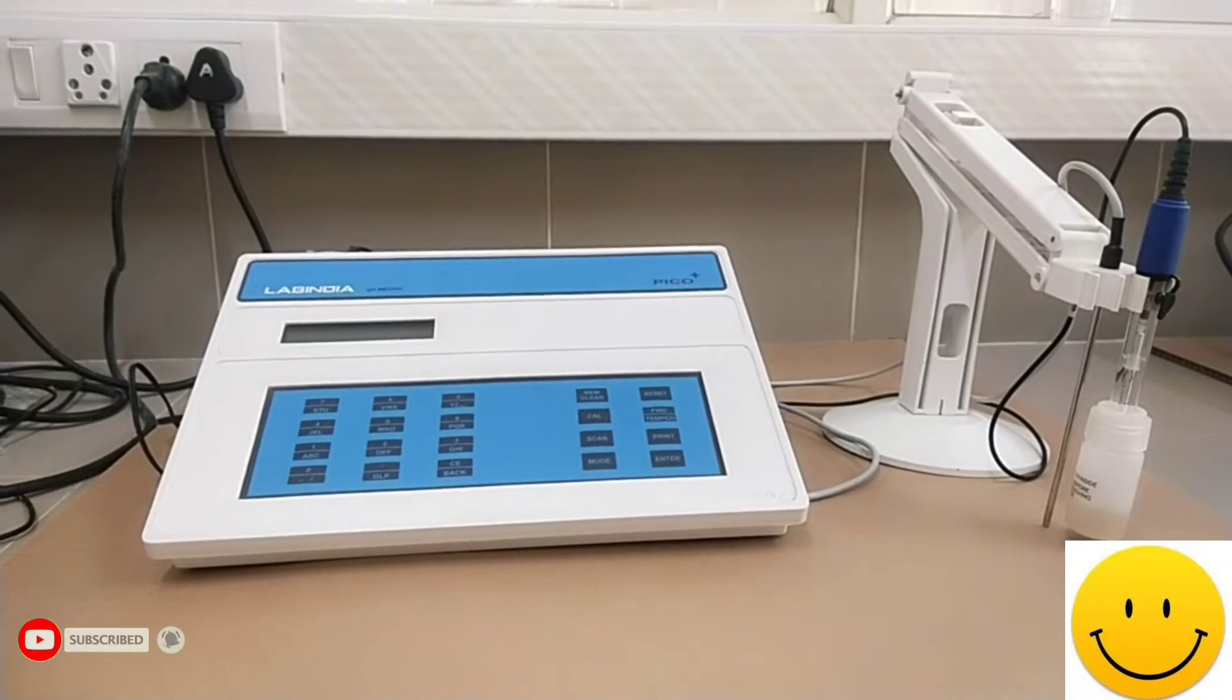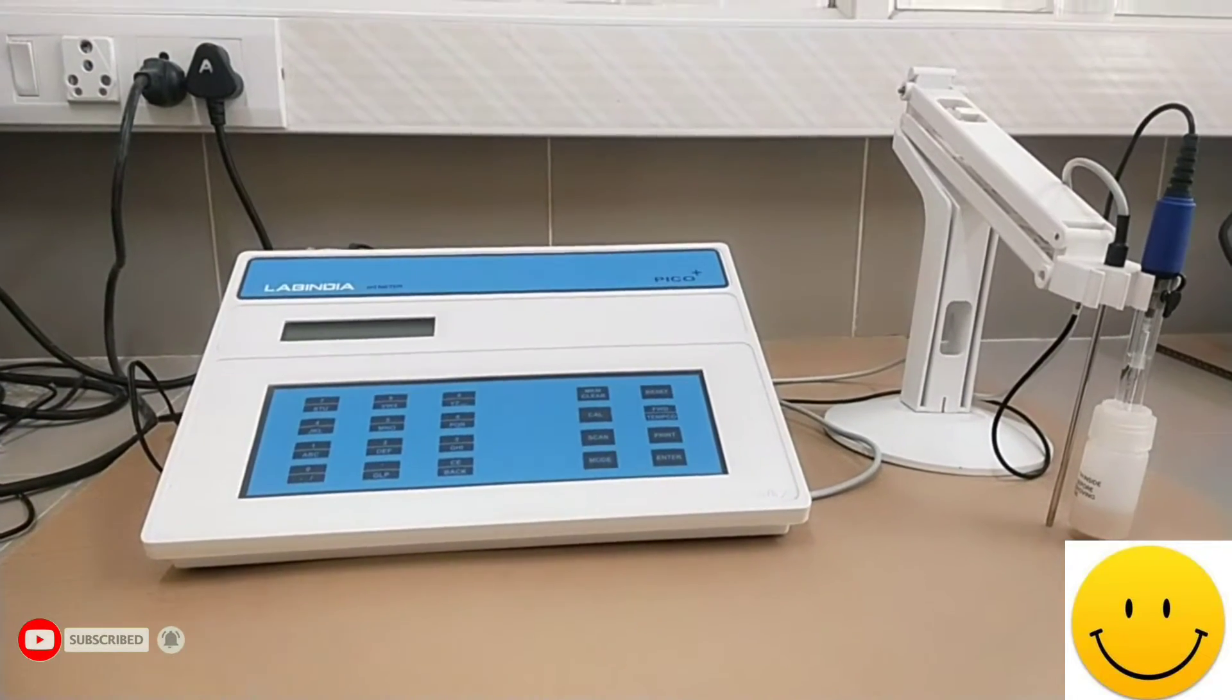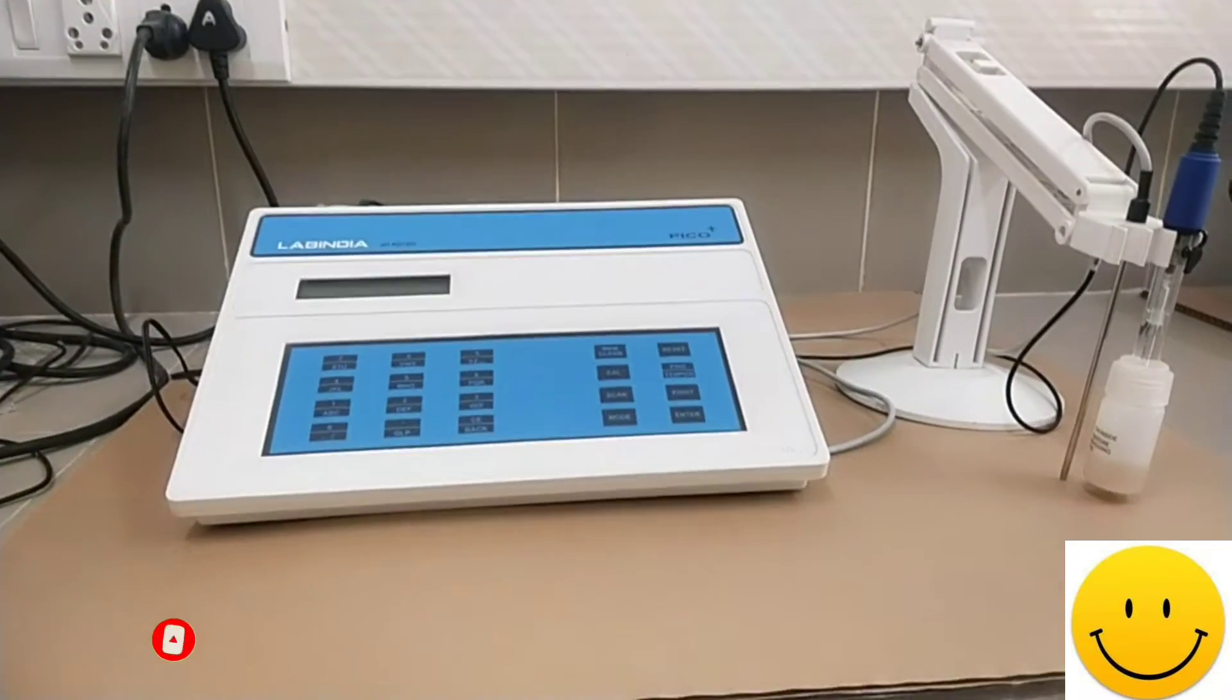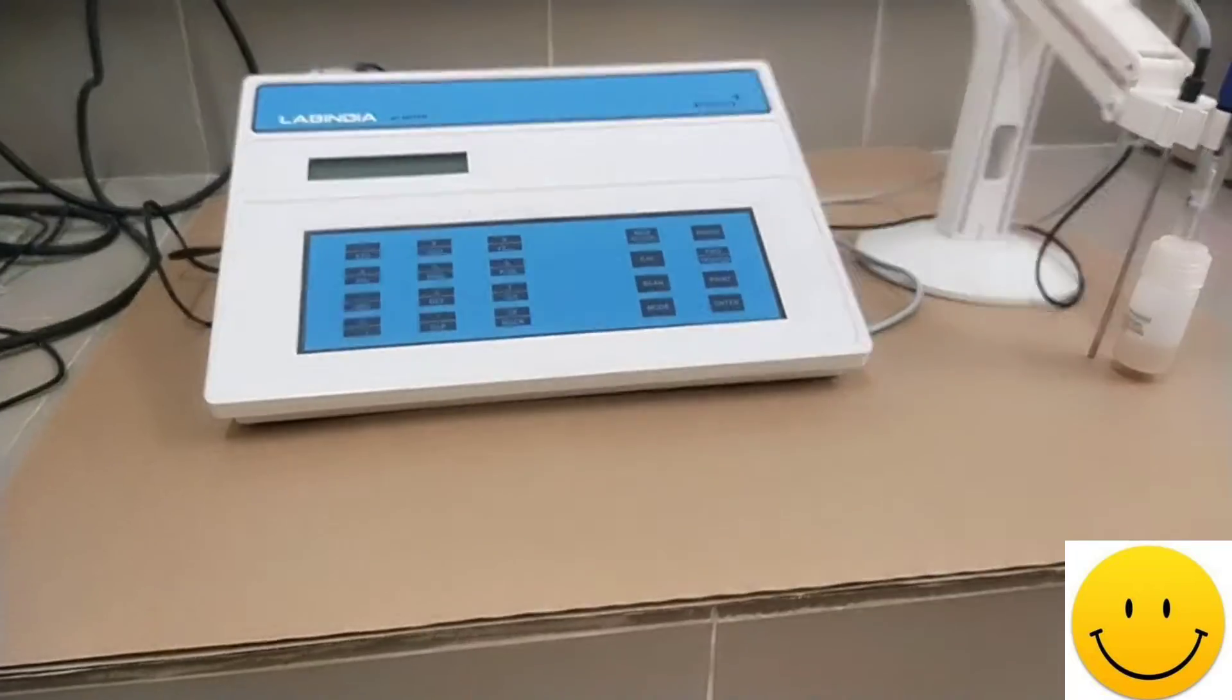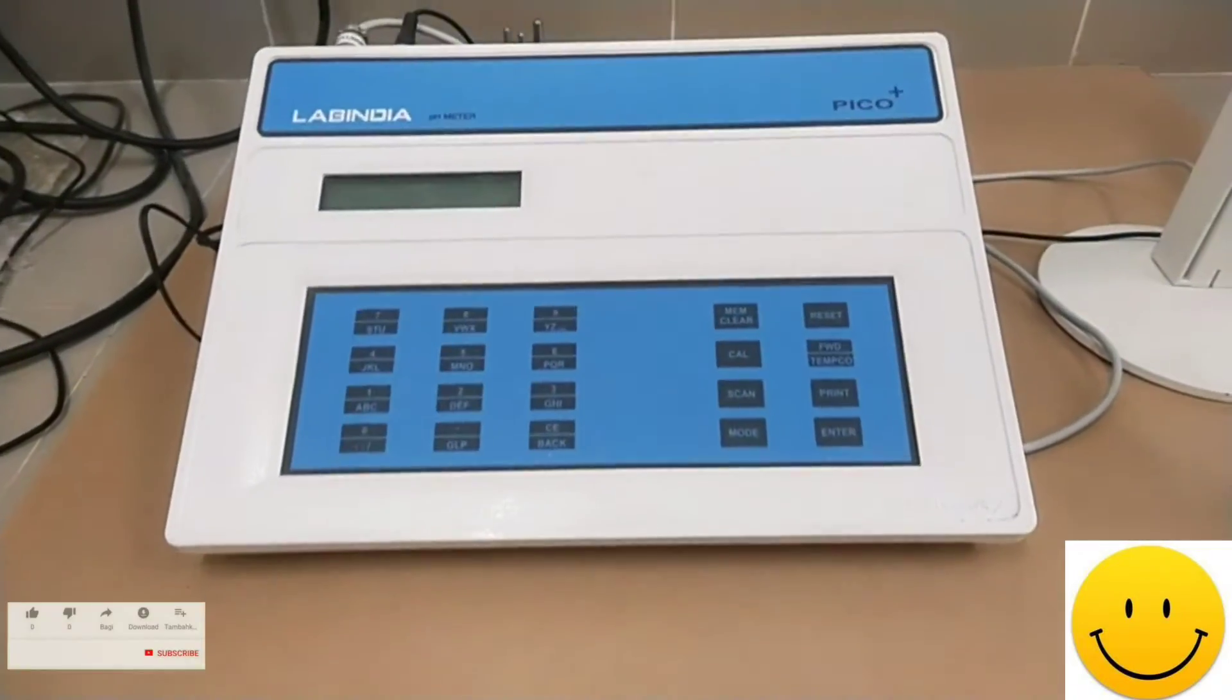Good day. Today we have a look at pH meter instrument, calibration of pH meter and sample analysis.